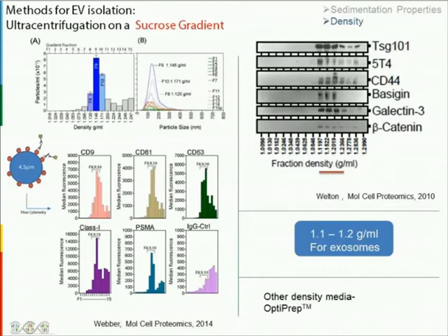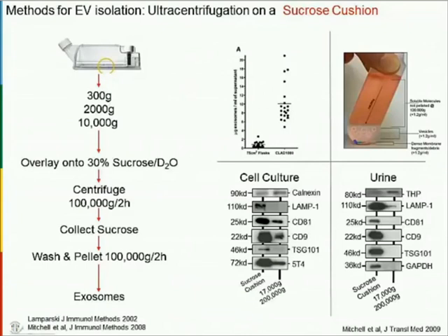This slide shows you the typical workflow for my lab, and I'm bringing together multiple elements here just to demonstrate and give you an example of how difficult it can be to get good quality, high-yield exosome preps set up in your lab. Firstly, we start off with these bioreactor flasks. We're already concentrating the exosome vesicles in the supernatants before we even start, so this gives us an 8 to 10-fold concentration of vesicles. Then we do some pre-clearing steps.